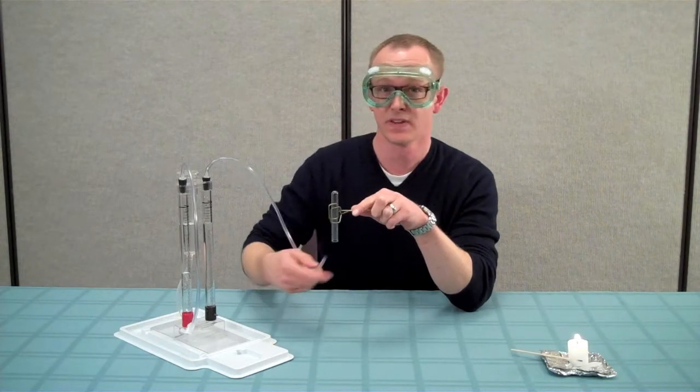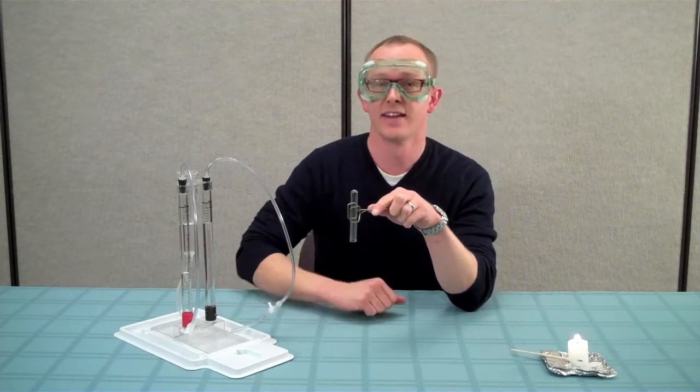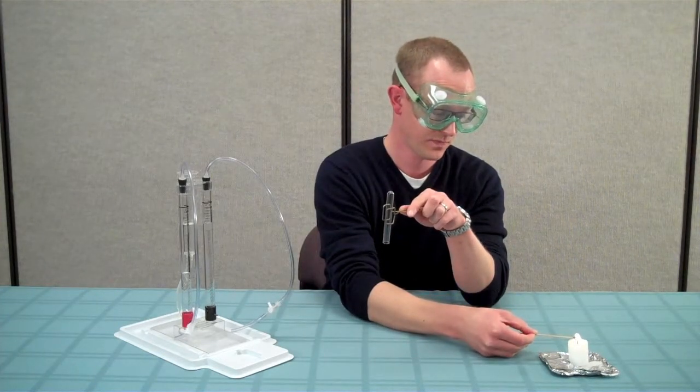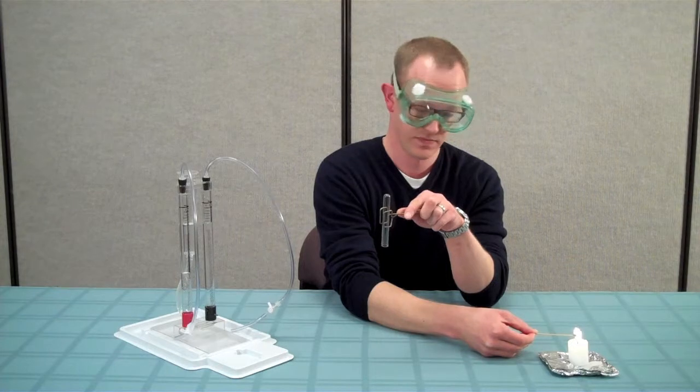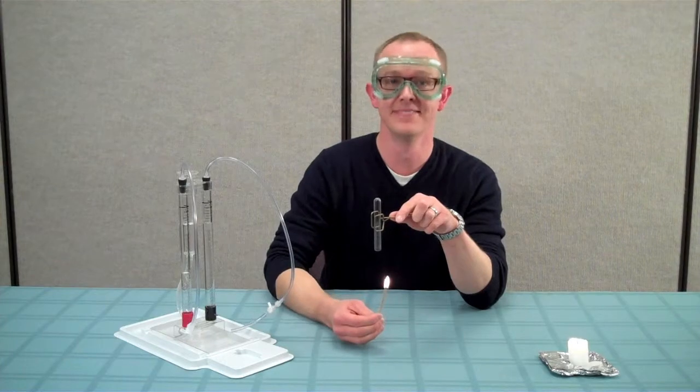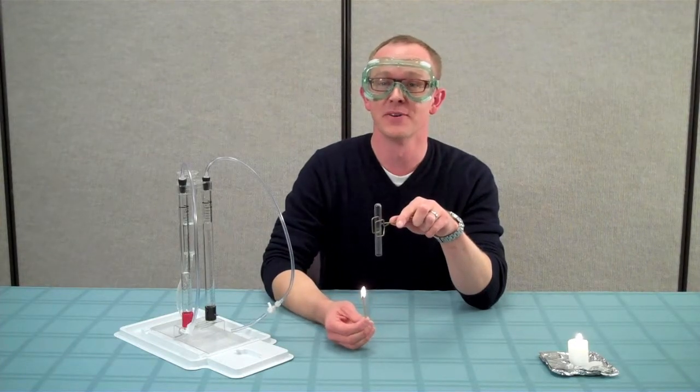Remove the tube and take a burning splint and insert it into the mouth of the test tube. Now, we should hear a noticeable pop sound. The gas that was in the storage column must have been hydrogen.